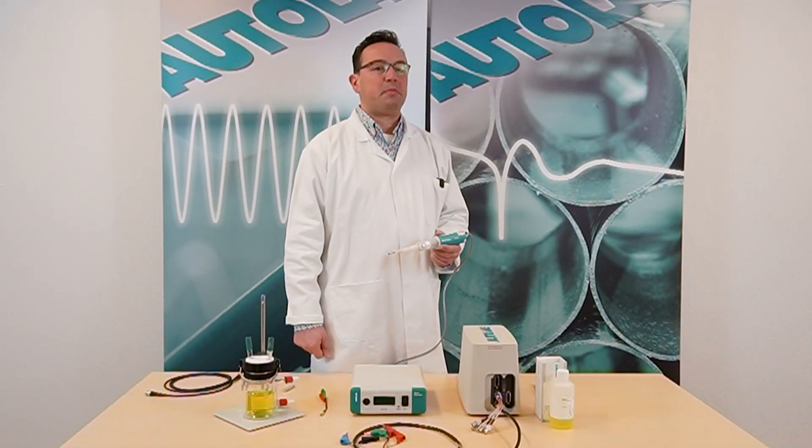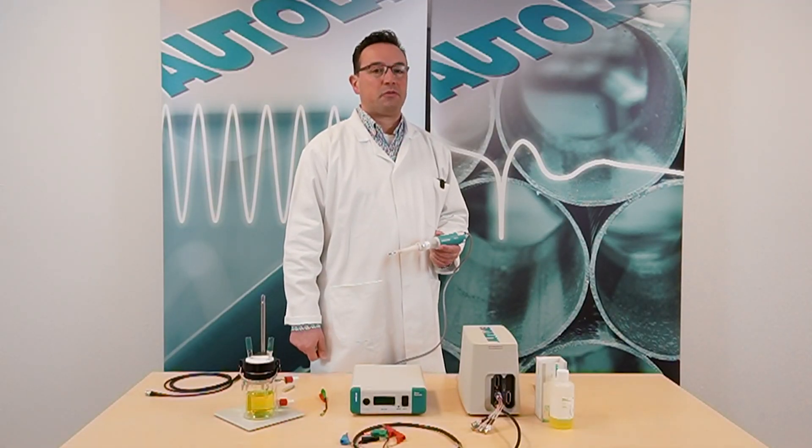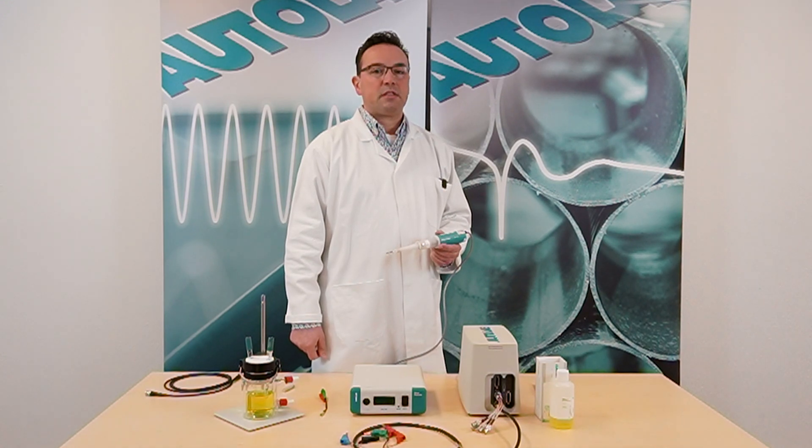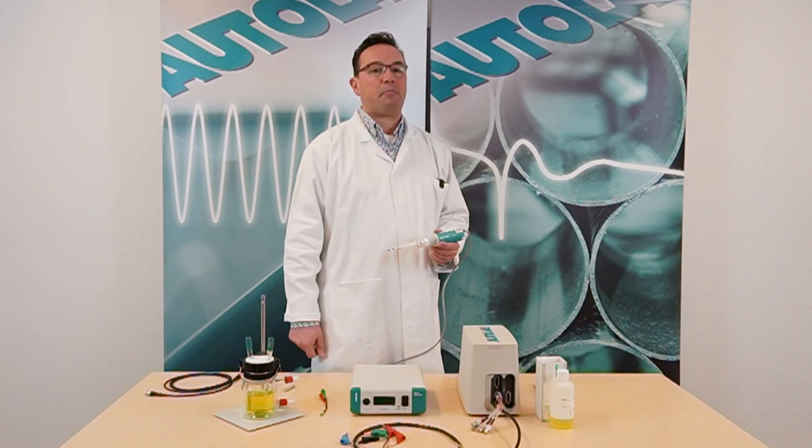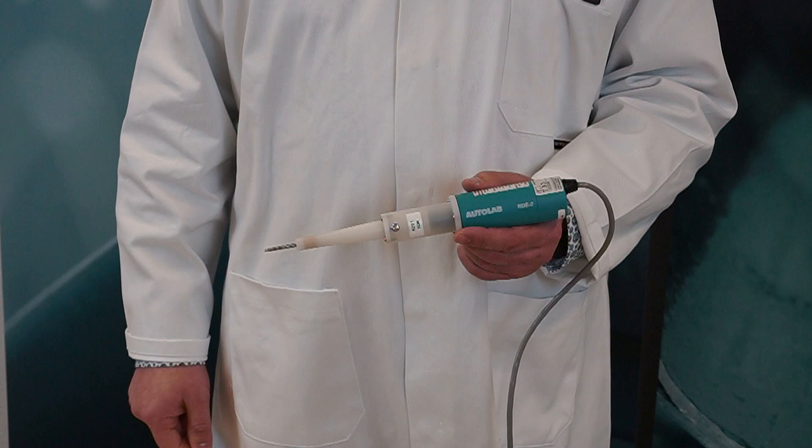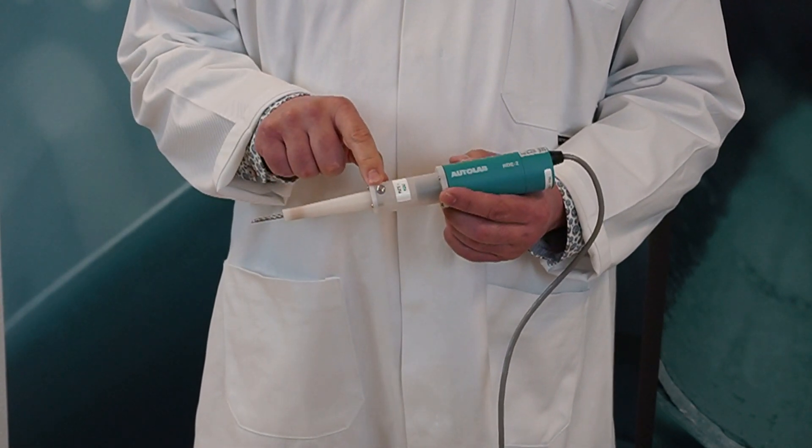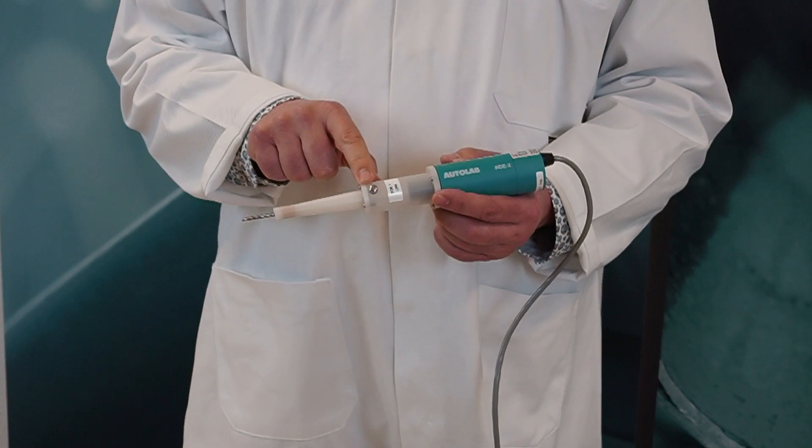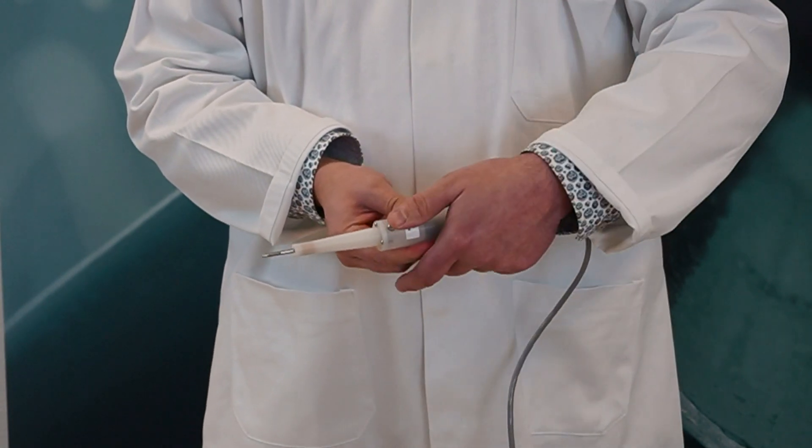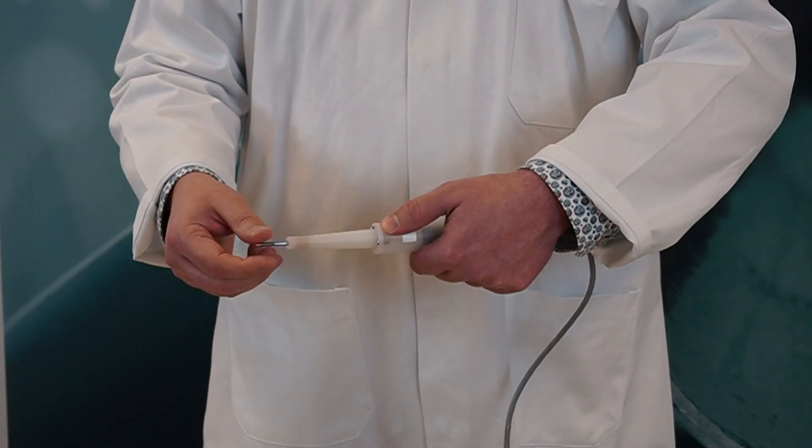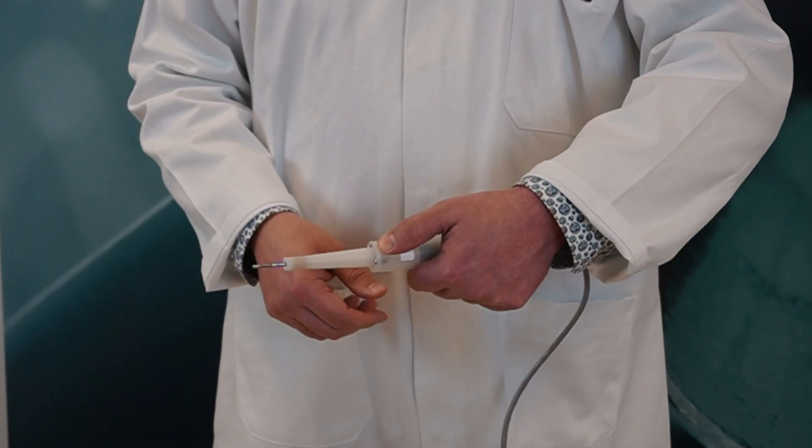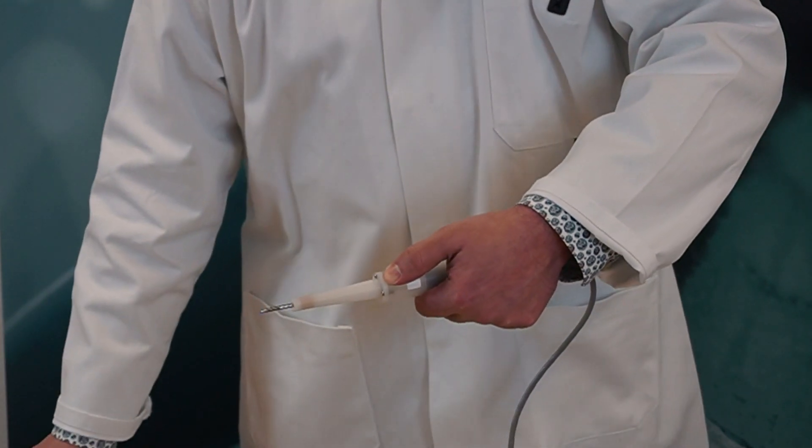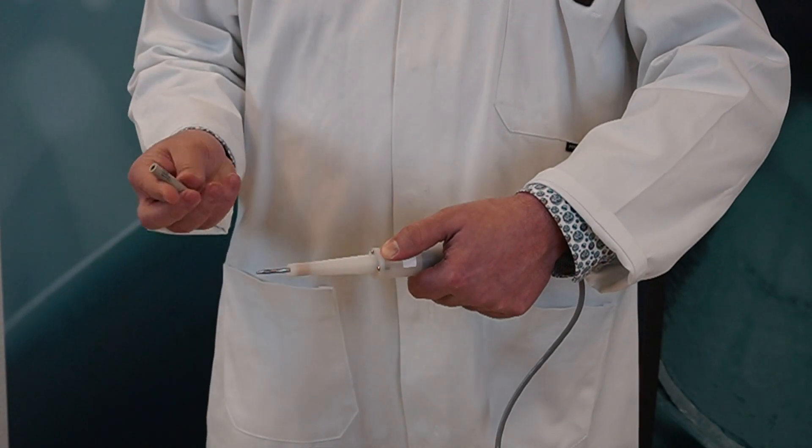We are now going to attach the platinum electrode tip to the axle of the rotator. To do this, keep the axle fixed in place by pressing the axle blocking button on the rotator. This is the axle blocking button. During rotation of the axle, the block button will click in position. So we hold it and we turn the axle until we hear a click. Now the axle is fixed, then gently screw on the electrode tip.